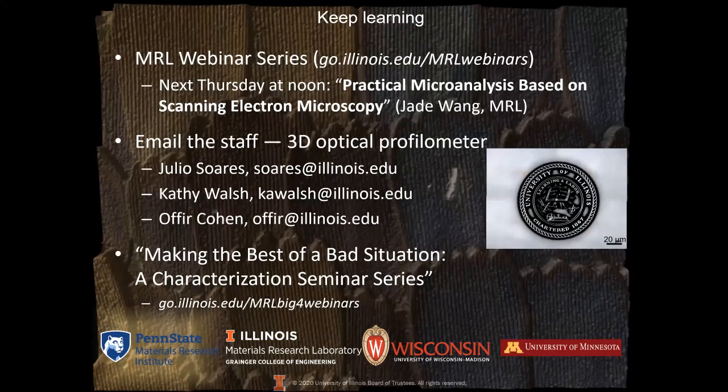Can you comment on what types of samples would be better to be done with focus variation versus confocal versus interferometry? Yeah, so if your sample is large, in general, to save time, you would like to do it on focus variation. If you're interested, like Kathy said, in the case of the O-ring, for example, on the very tiny little nuances of the interface, it's still better to do it in confocal mode, but it takes much longer time to do that because you're scanning the image.